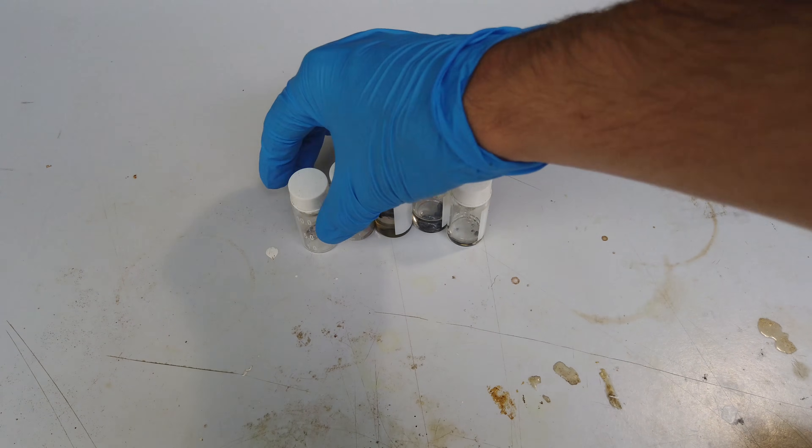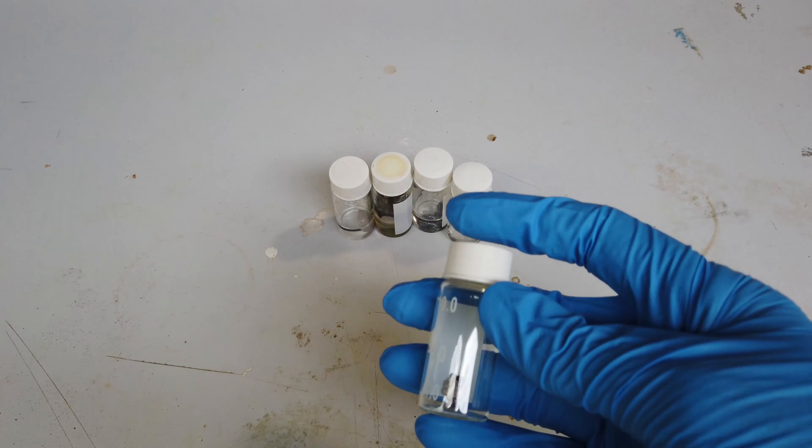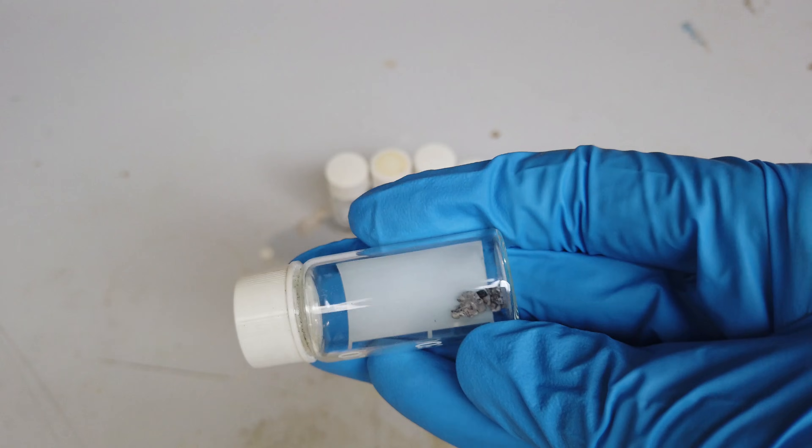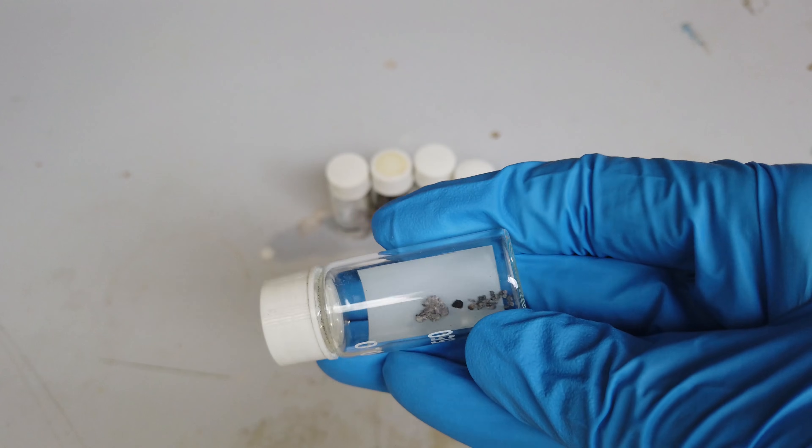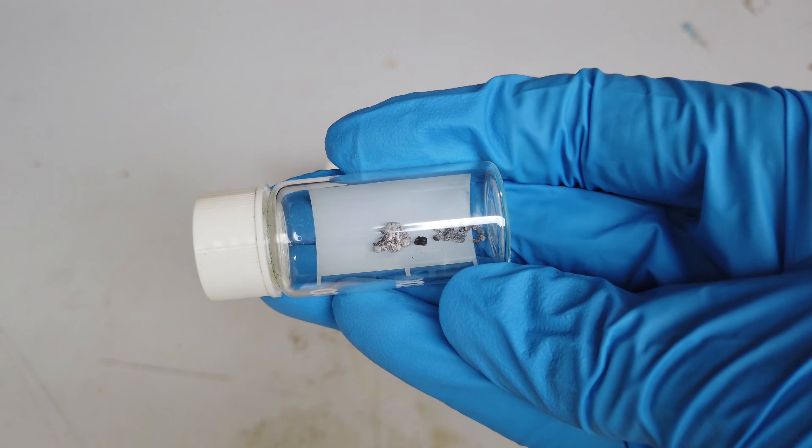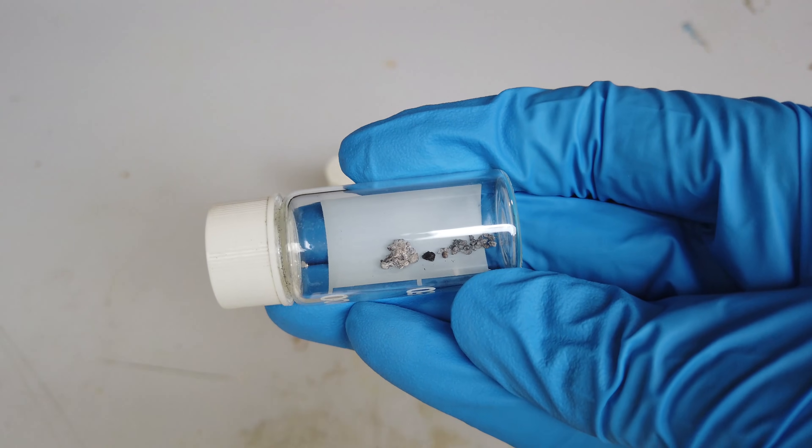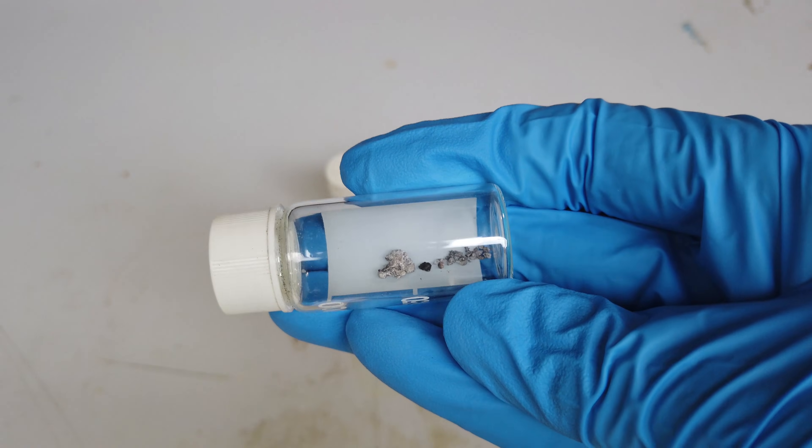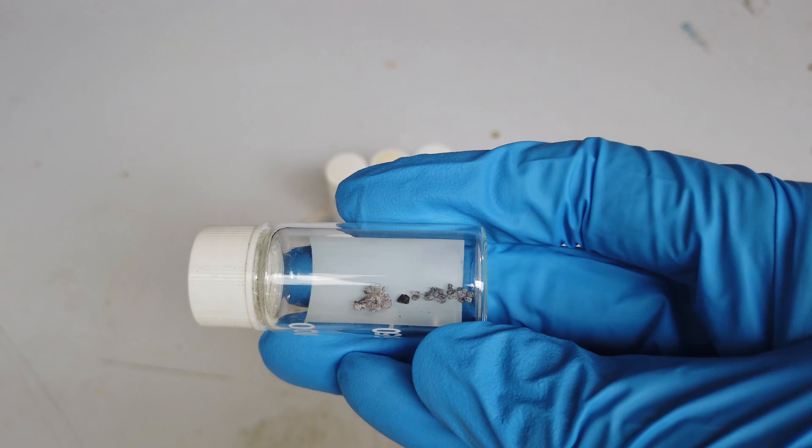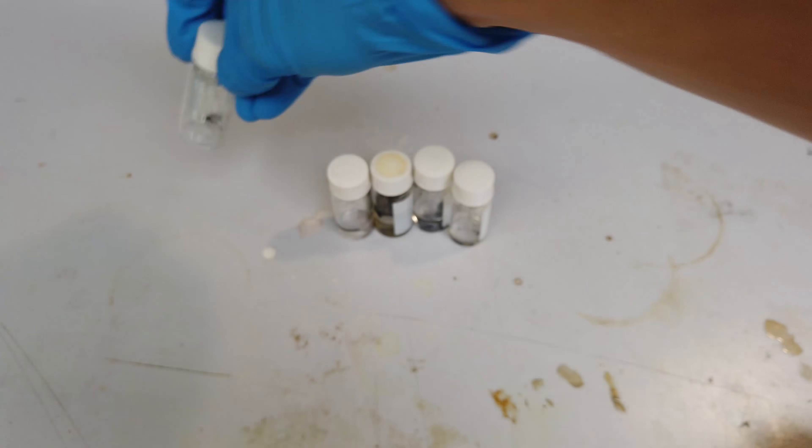We have had some successes in the past. In particular, we made some Aluminium Metal. This was made by the Hall-Heroult Process, where we electrolyzed some Aluminium Oxide dissolved in Molten Cryolite. Aluminium is of course stable in air, so there's no maintenance that needs to be done for that one.